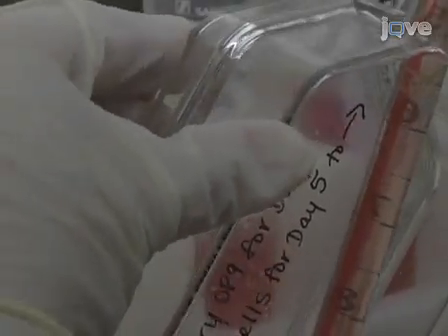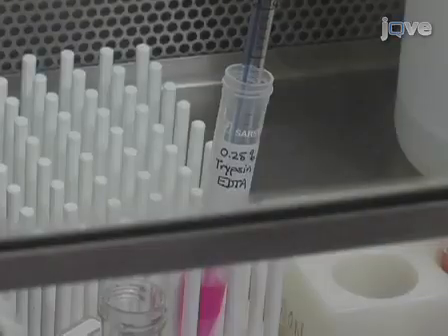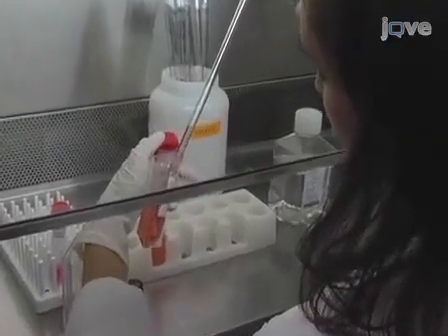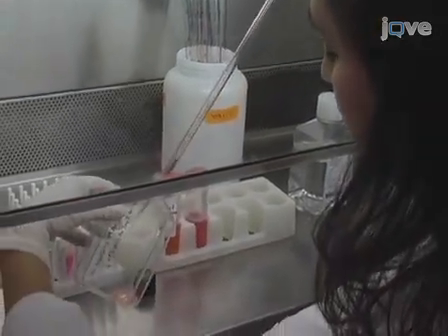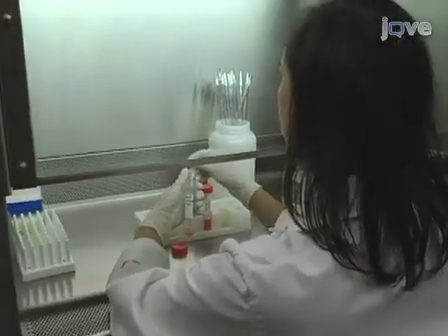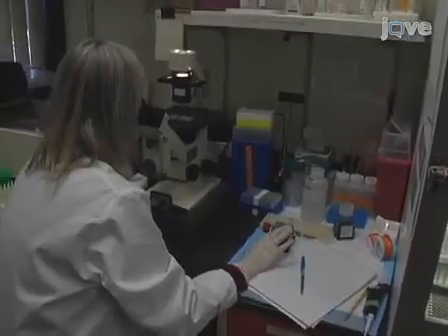Remove the media with the hematopoietic cells and reserve. Wash the monolayer one time with PBS to remove hematopoietic cells in suspension and reserve. Add 0.25% trypsin EDTA to flask. After trypsinizing adherent cells, wash cells off the flask with ES differentiation media and add to the hematopoietic cells found in suspension. Pellet cells at 400 G for 7 minutes at room temperature. Finally, resuspend the cells using a 21-gauge blunt-end needle and count the cells. The cells are now ready to be replated or used in downstream assays.